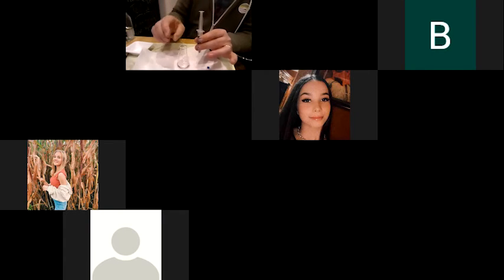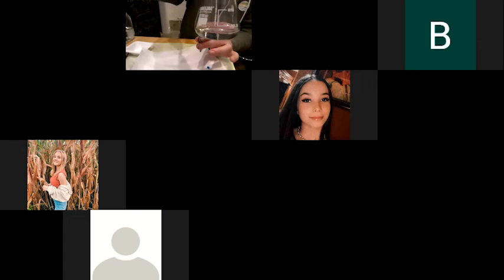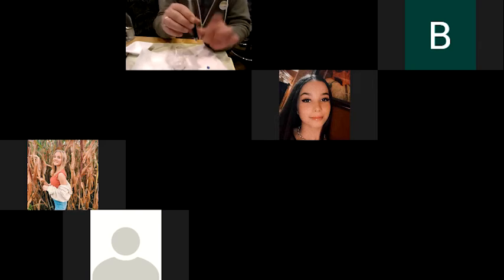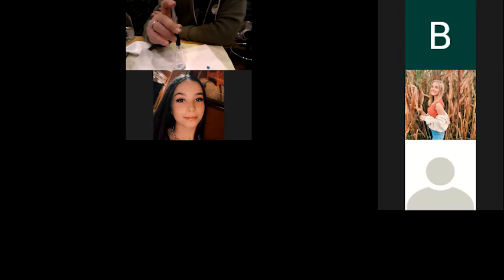Now notice there's a little bit of blue in there, but when we swirl it around, it goes clear. That's because without mixing, there are going to be small little areas where you have unreacted molecules. But when you mix it up, they'll react. So you want to go drop by drop here. You don't want to add a whole lot at a time.